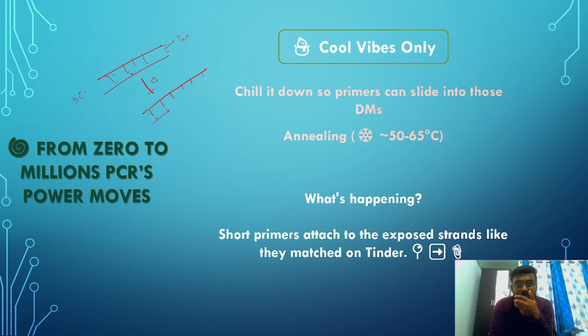These things need to be very accurate, very precise. If this is precise, then your DNA and all the rest of the things will be precise. That's the thing. It's like matching on dating sites, dating apps. It's similar to this only. Both sides need to be right. One right, one left, it will not work. Both right, okay, we are a perfect match. Let's go for the reaction.